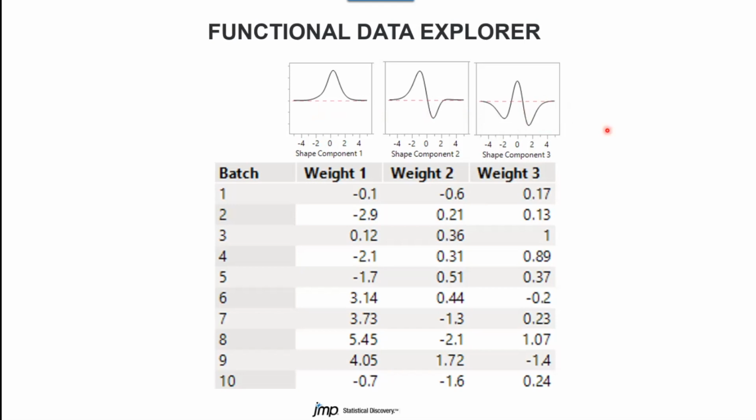Thanks, Chris. And we just got another question. Great. Will you then use the profiler to optimize these shape components? You can do that. We have a functional principal component profiler that you can do that with.